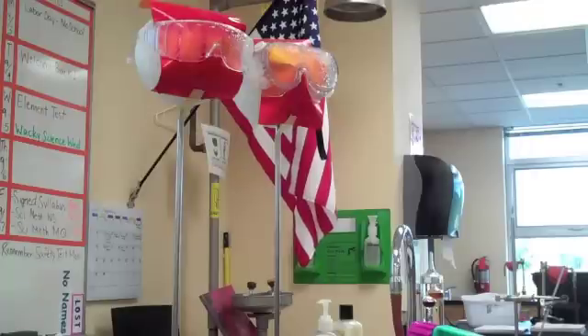We always put our goggles on for any labs. This will be a good thing for your test on Monday. You always wear your goggles if anyone in the class is doing a lab or anyone in the class is working with glassware.